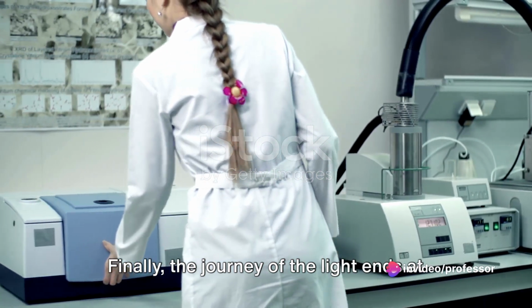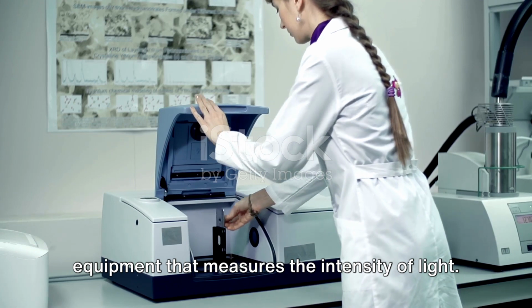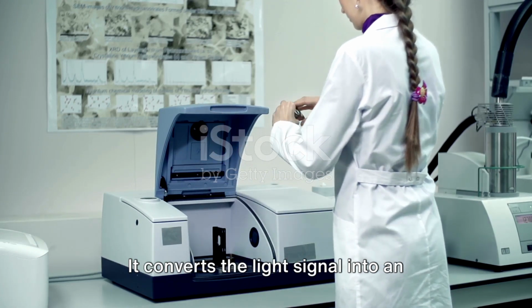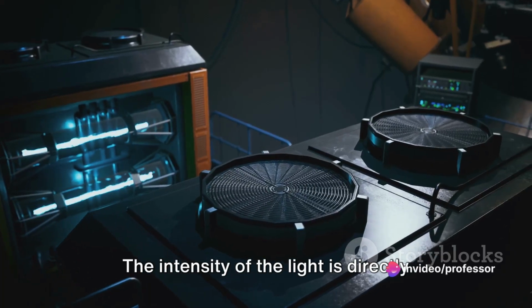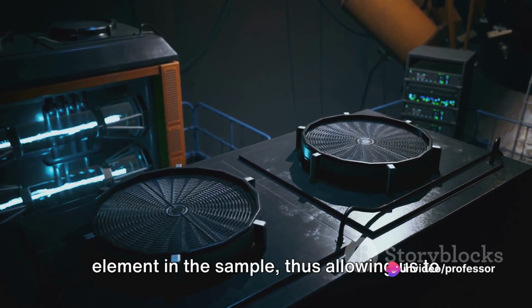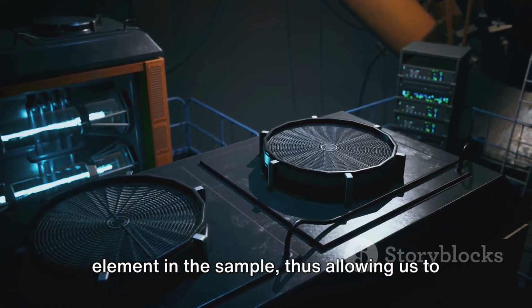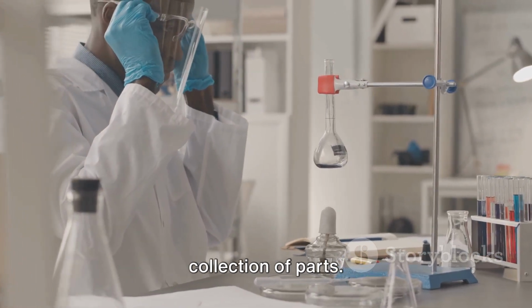Finally, the journey of the light ends at the detector. The detector is a sensitive piece of equipment that measures the intensity of light. It converts the light signal into an electrical signal, which is then amplified and displayed as a reading. The intensity of the light is directly proportional to the concentration of the element in the sample, thus allowing us to quantify the element. But a flame photometer is not just a collection of parts.